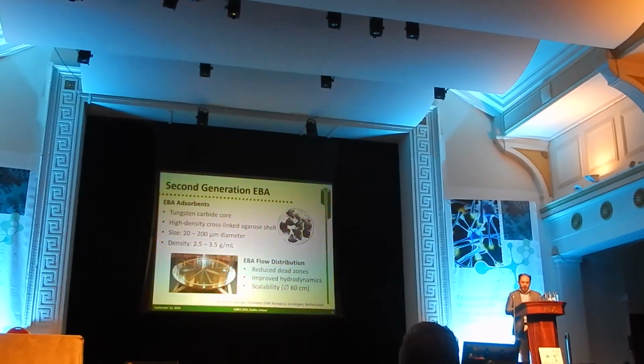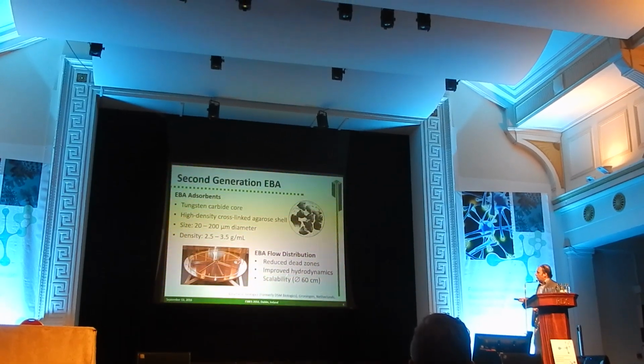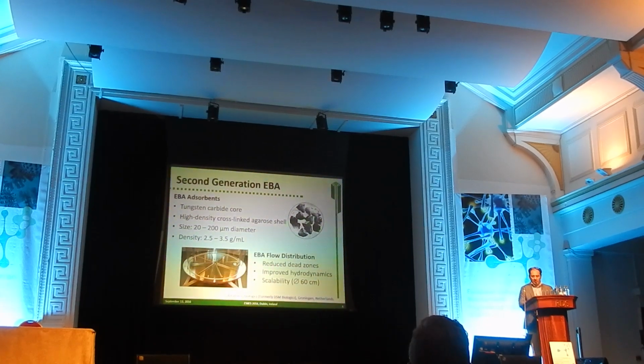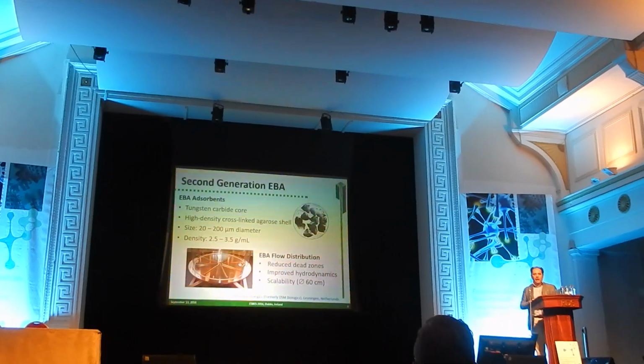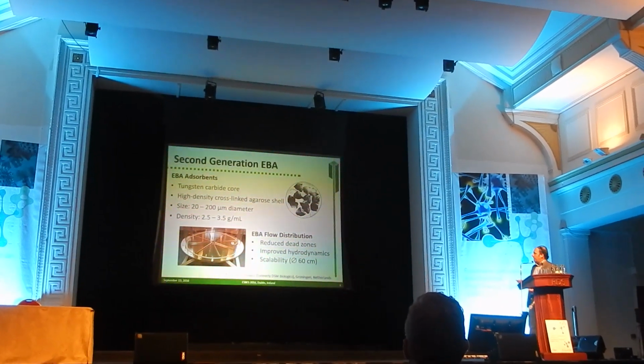Also, people noticed problems at the level of the flow distribution, so some attempts have also been made to get specific devices that would control the flow distribution at the bottom of the column. So this is basically the situation now.